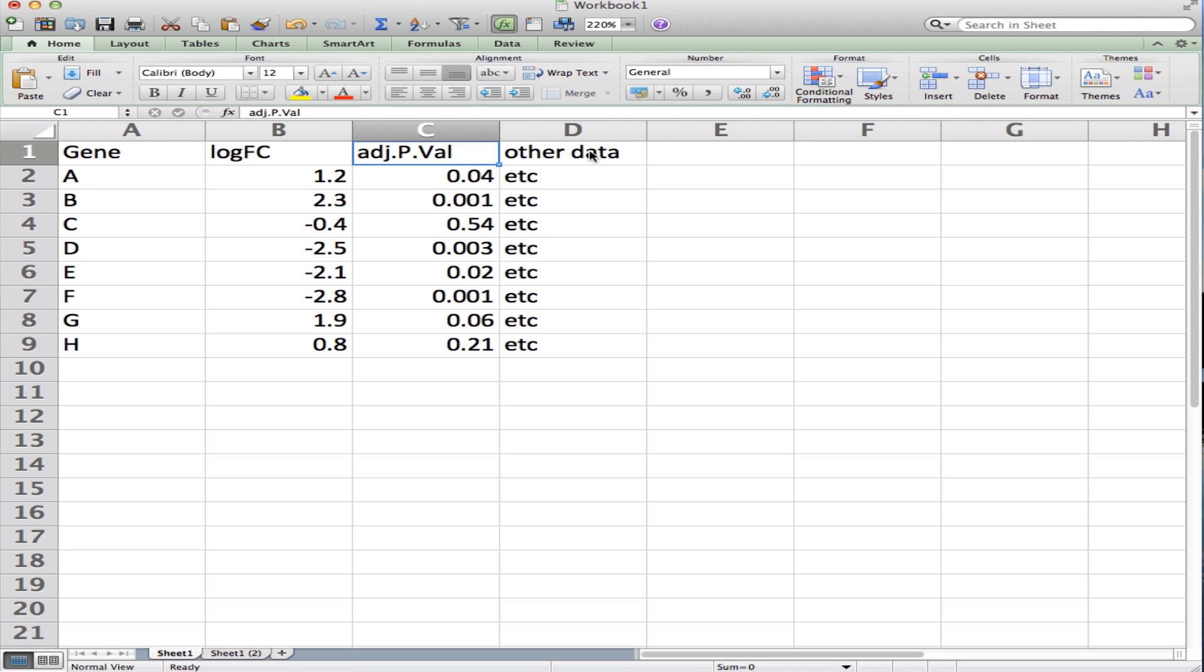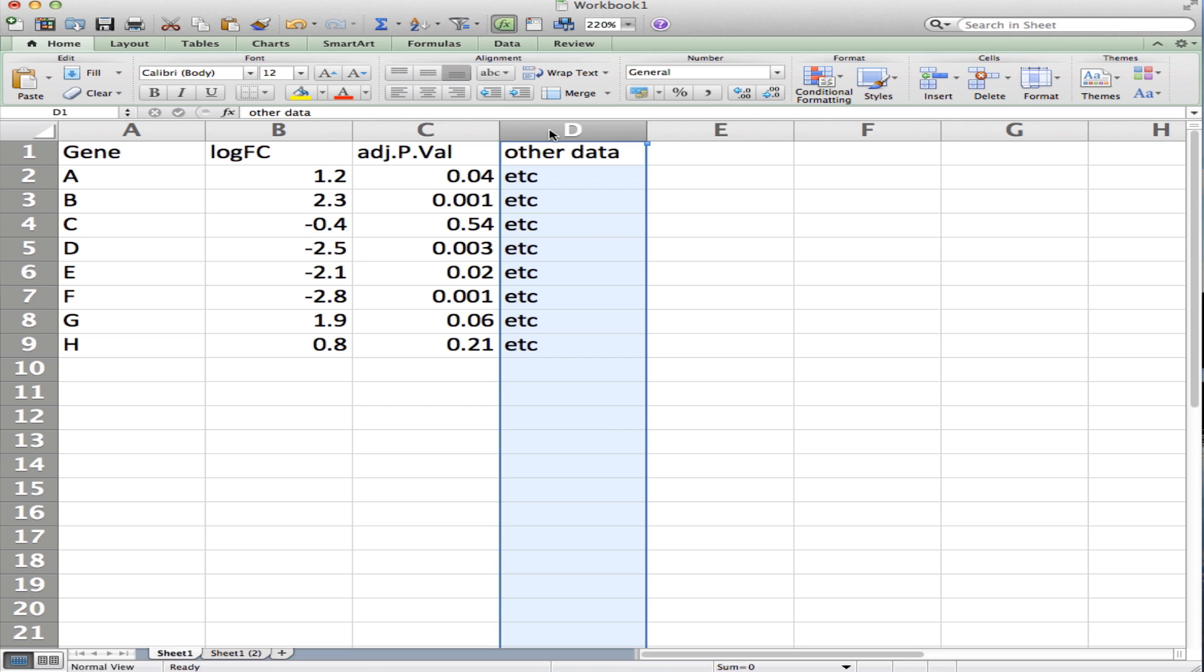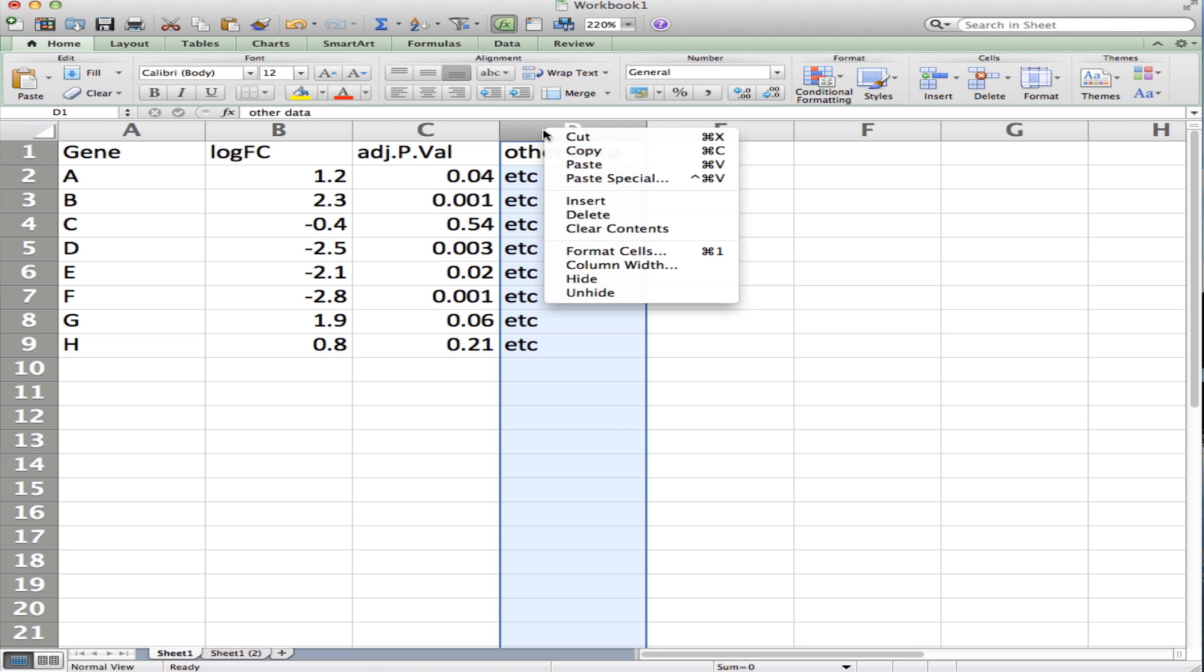If you want to look at only the genes with the highest fold changes in either direction for genes that are significant at a false discovery rate of 0.05 or less, it's relatively easy to do that. First we will create a new column here, so I'm going to right-click in front of the column that I want to insert an extra column.